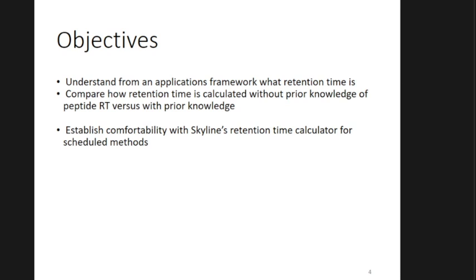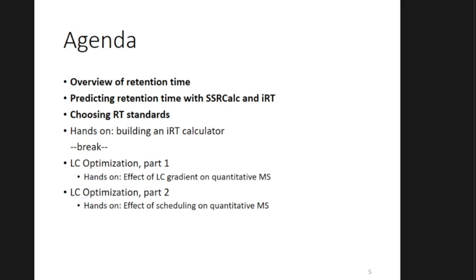One of the ways is I have no prior knowledge. All I know is my peptide sequence, the specific amino acid letters of the peptide. And the other way is you can use standards. In the second half of this 1:30 session, I'll spend some time introducing you to these concepts, and then Brendan's going to walk you through a step-by-step tutorial of building one of these retention time prediction calculators in Skyline. So first I'm going to be just introducing you to these concepts before we go ahead.